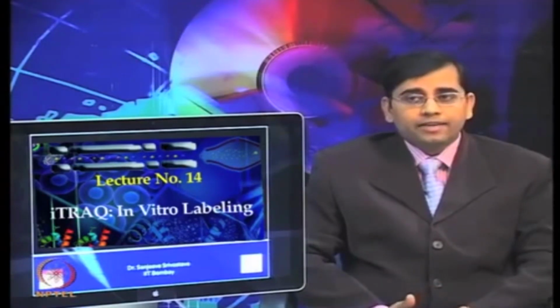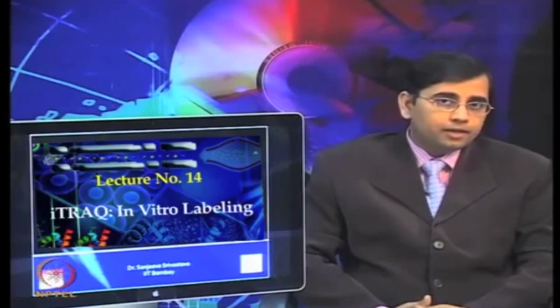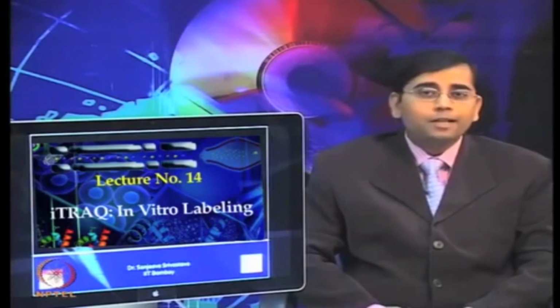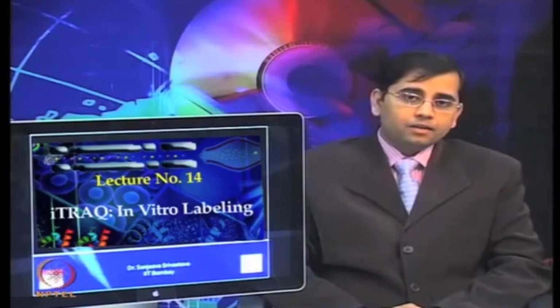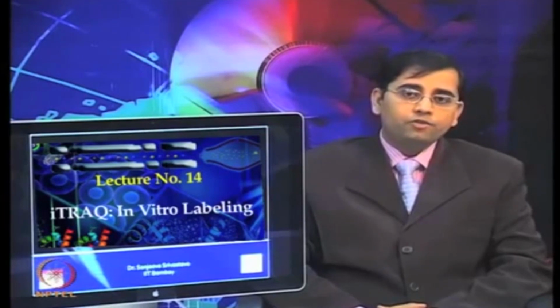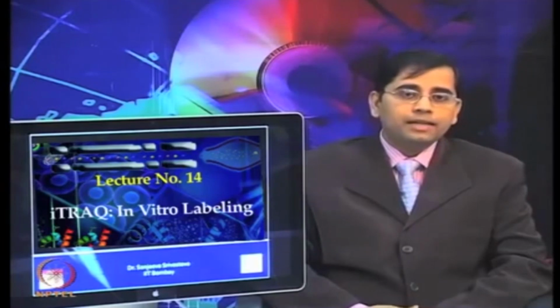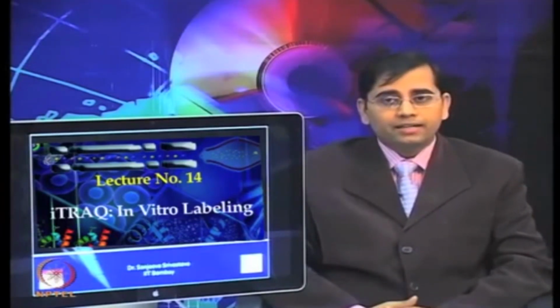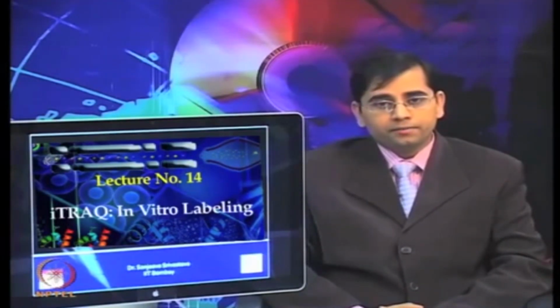Various techniques or strategies have been developed for quantitative proteomics, including gel-based approaches such as DIGE, and mass spectrometry based measurements. ICAT was the first generation MS based quantitative approach for quantitation of relative levels of proteins in control and treatment samples. The ICAT reagent, as we discussed, consisted of three components: the thiol functional group, a linker group and a biotin moiety.